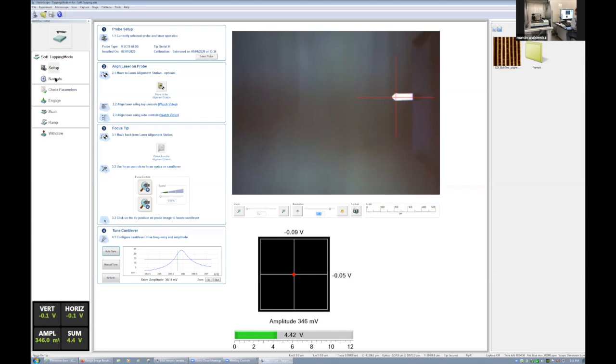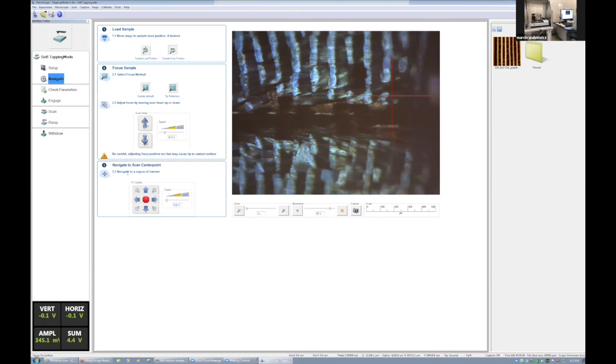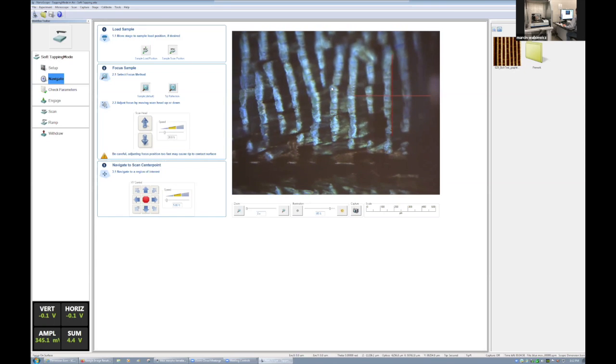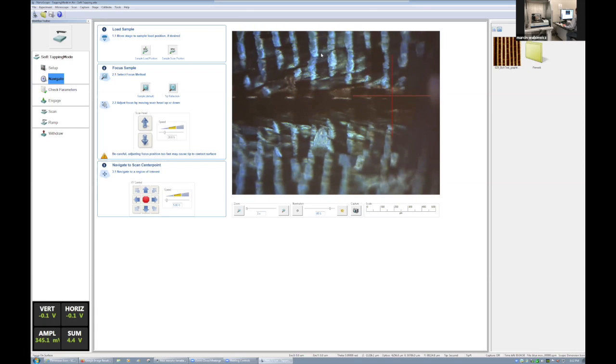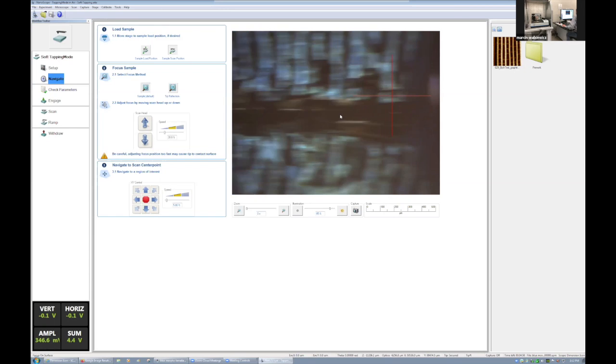And now in navigation, you can see the surface of that butterfly wing. So that butterfly wing is made of tiny little scales, so to speak. You can see them. Some of them will move. That's why when you catch a butterfly, it's going to have this little dust that stays behind. Those are little individual scales. And then we're going to look at one of those scales.